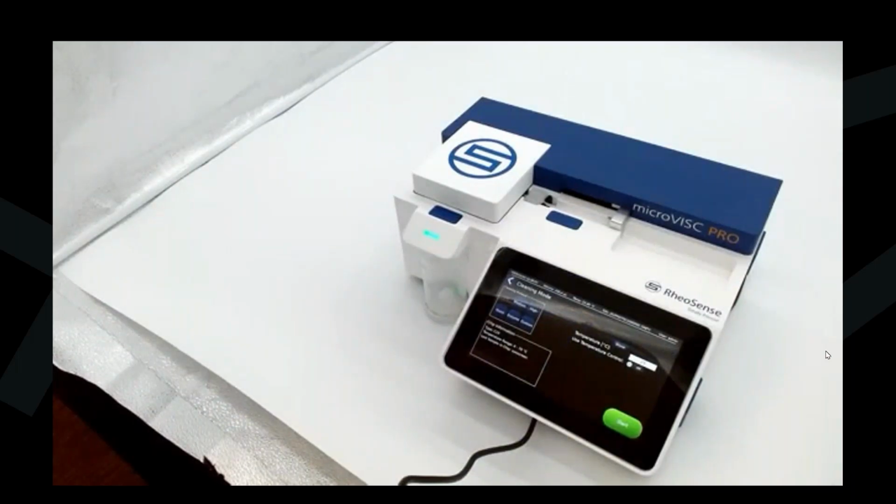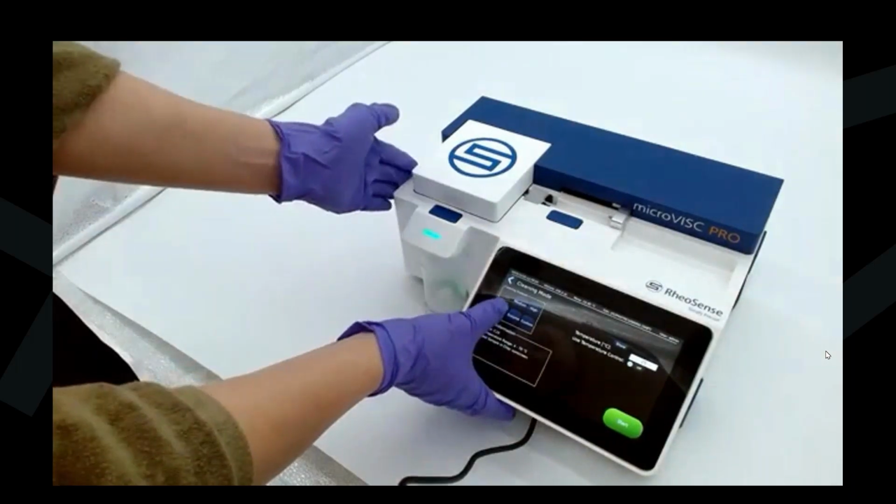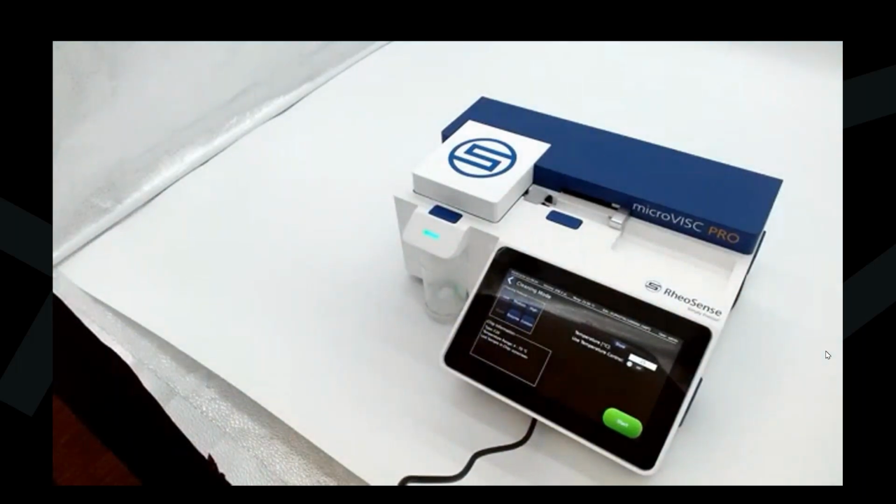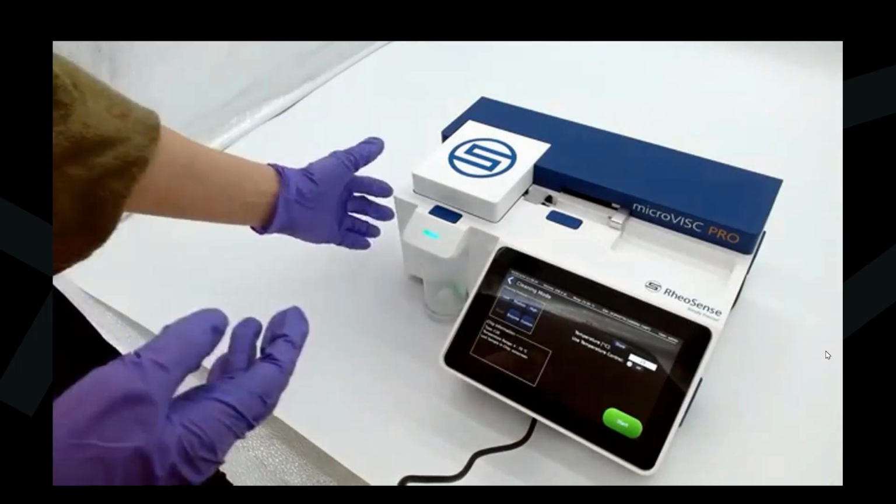And here you have multiple cleaning modes for your sample. So you have a mode for low, medium, or high viscosity samples. There's also a quick cleaning mode on the bottom left. And another option is for enzyme cleaning. So that's more if you have protein samples where you're using an enzymatic cleaning solution.